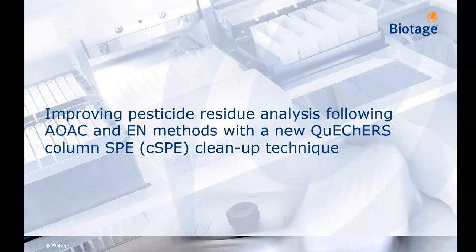I think what I have in store for you is a very interesting story about comparing two cleanup formats for QuEChERS cleanup technique in the food analysis industry.